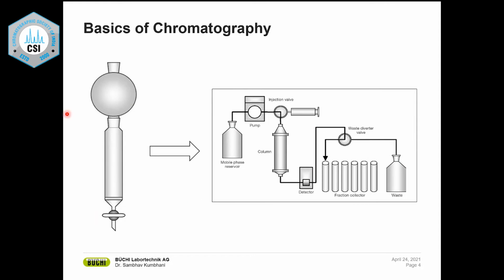The column still had what we call a stationary phase, and there was a mobile phase, which is in liquid state, introduced from the top. The sample is dissolved in your mobile phase, and then the sample interacts with both mobile phase and stationary phase, gets partitioned between both and gets separated in the column. Once separated, they get eluted one at a time at the end. So that's the basic principle of chromatography, which holds true for any kind of chromatography.